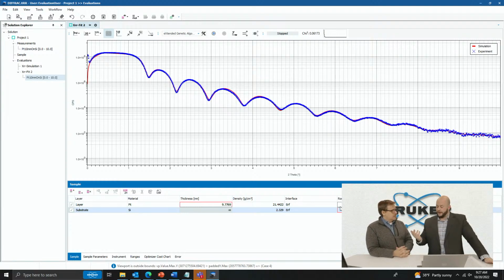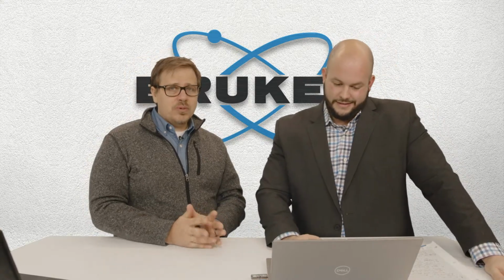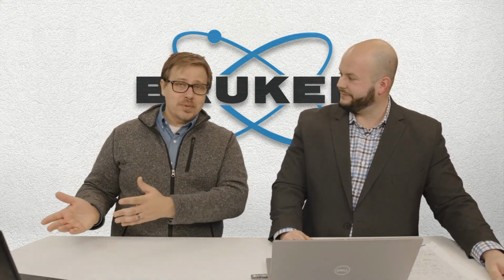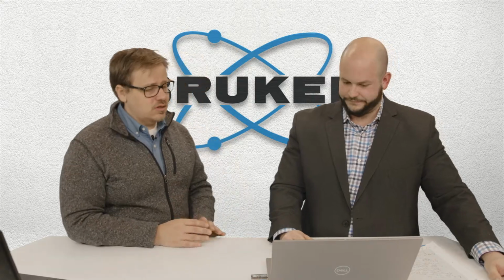Yeah, that's a great point. Sometimes it definitely helps to know what your deposition process is. Do I expect to have porosity in my films, things like that, right? But if you do have something like SiGe, where it could vary the density, and the density is actually linked to the composition, you can actually refine on that too. So that's another thing that you can do.